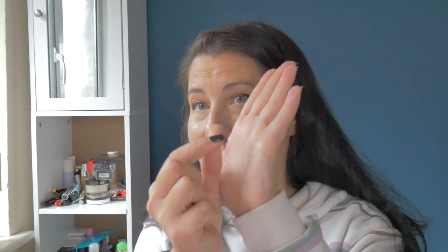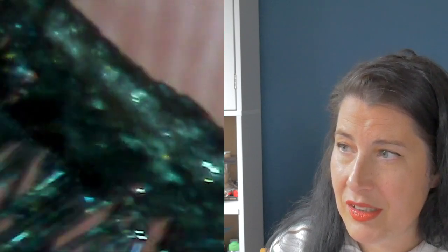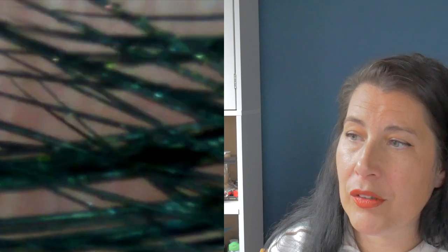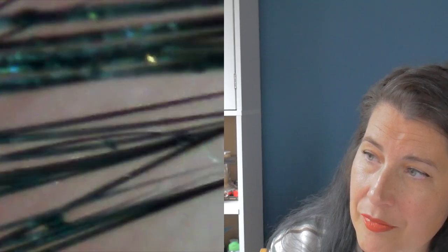Okay, we're going to have a look at some eyelashes. These eyelashes have been worn quite a few times. Look at the band — gunked up with all sorts. I pick off a lot of the glue. On the actual lash, some of them have got a little bit of mascara on them. But all in all, they aren't as hideous as what I thought they would be.